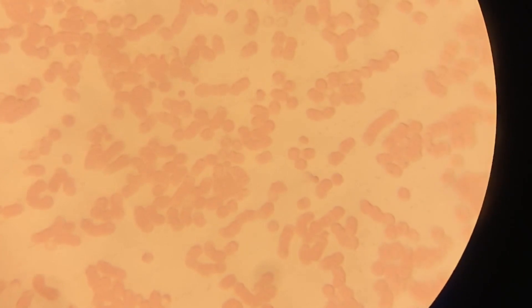Okay guys, this is my first blood sample. As you can see, the condition is not bad. During the last couple of weeks I've been trying to keep my blood as good as possible, so it's a bit complicated to find it in average or bad condition. Good blood means the blood cells are separated, because when they're separated they can transport oxygen to other body cells much more easily.